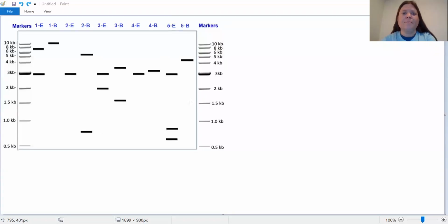This first video for Lab 7 is just a refresher on how to do restriction mapping of plasmids, because it's been a few weeks since you last had to do it, and not all of you have your course materials at the moment. If you feel comfortable with your ability to draw restriction maps of plasmids without going back through this video, feel free to skip to the next one. For those of you who would like a quick refresher, we're going to look back over the plasmid mapping exercise we did in Lab 6, just because that's the one most easily available to me.